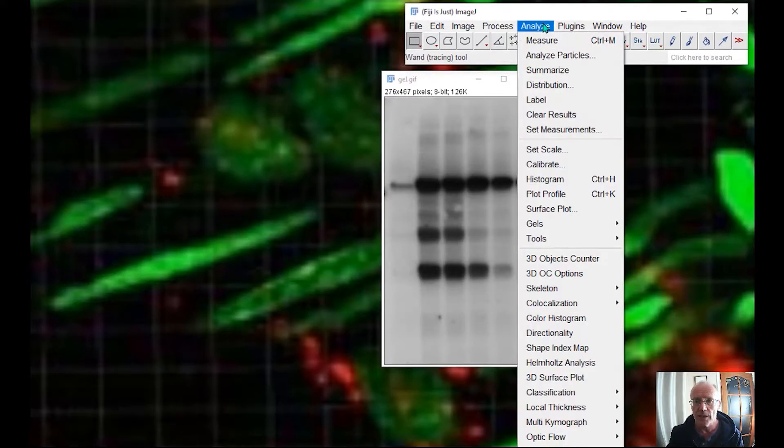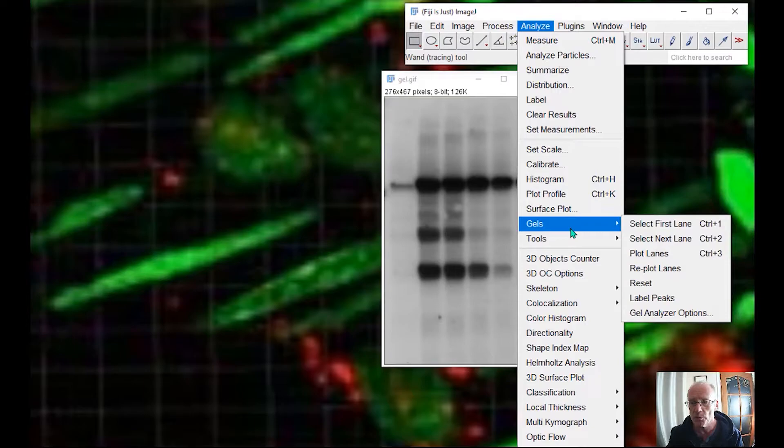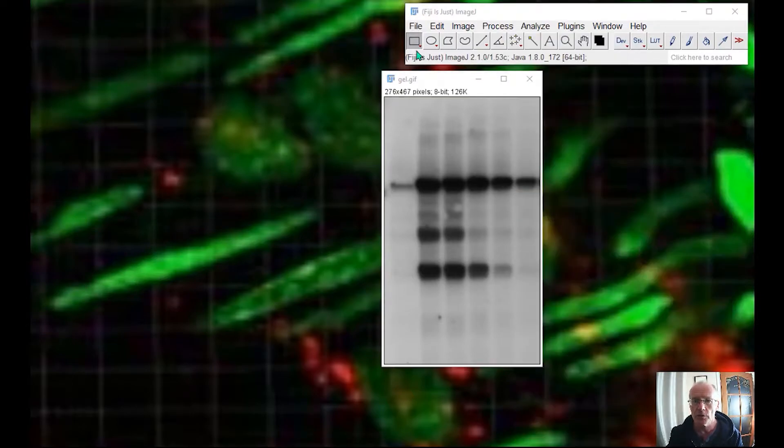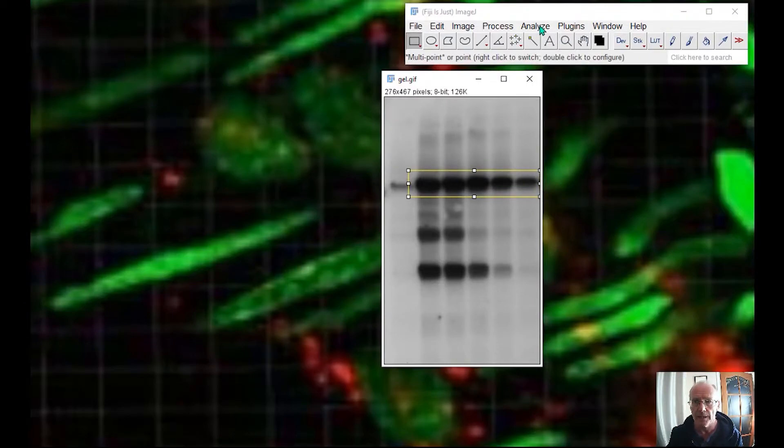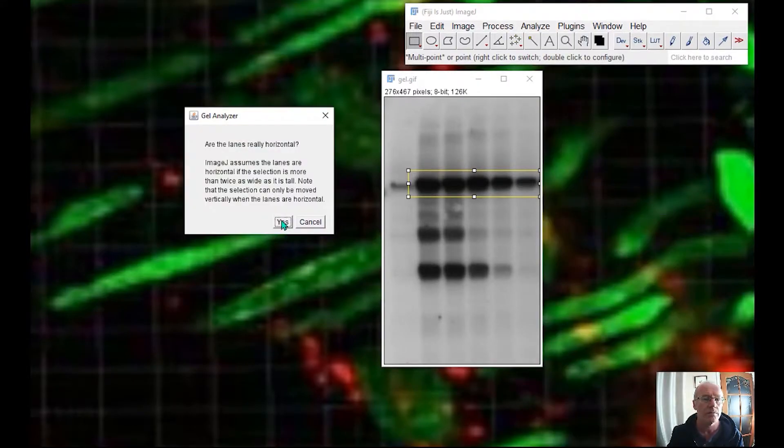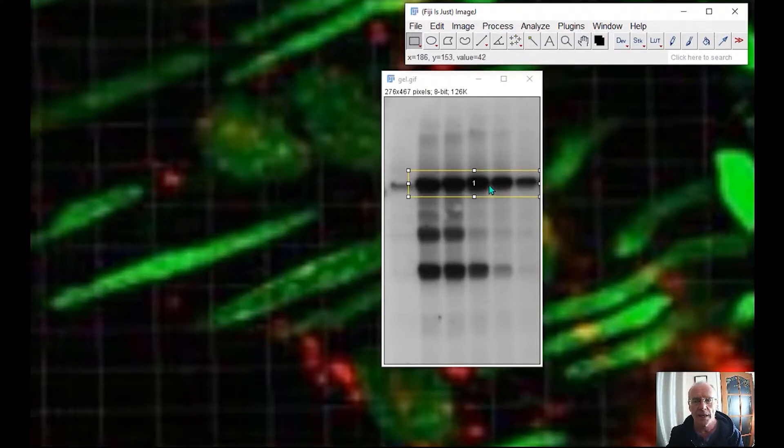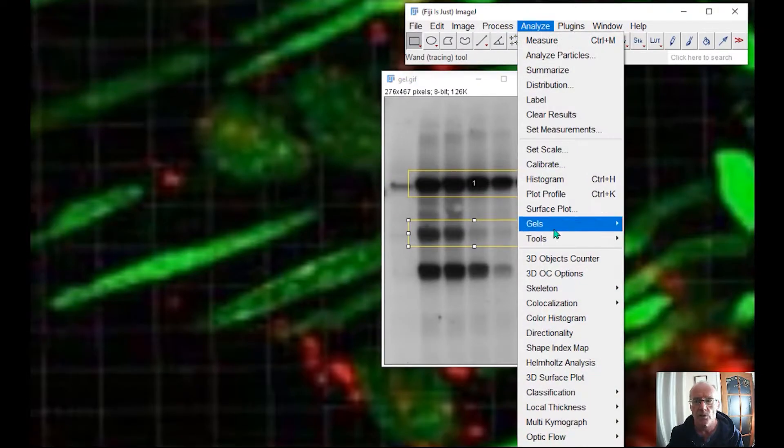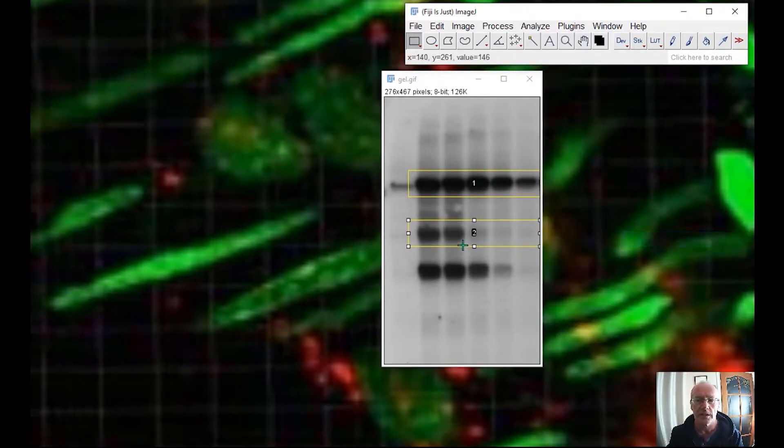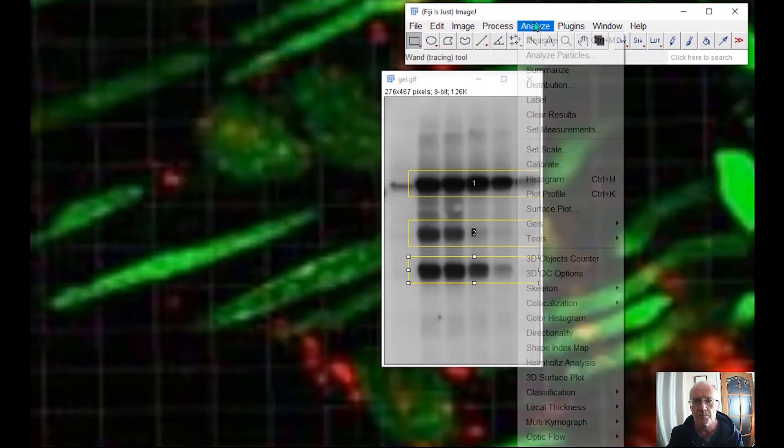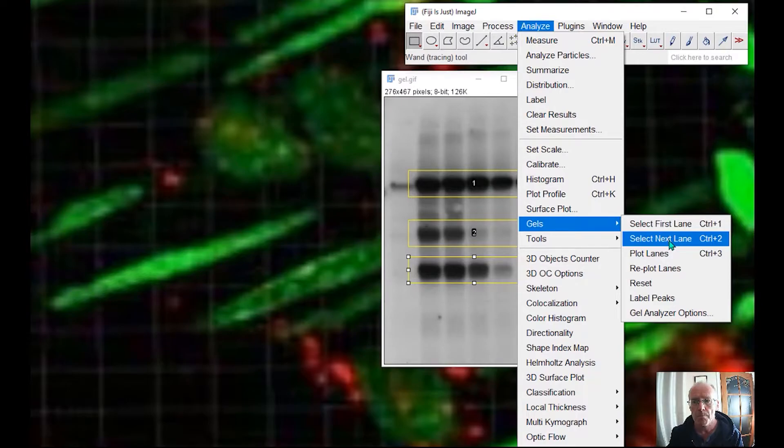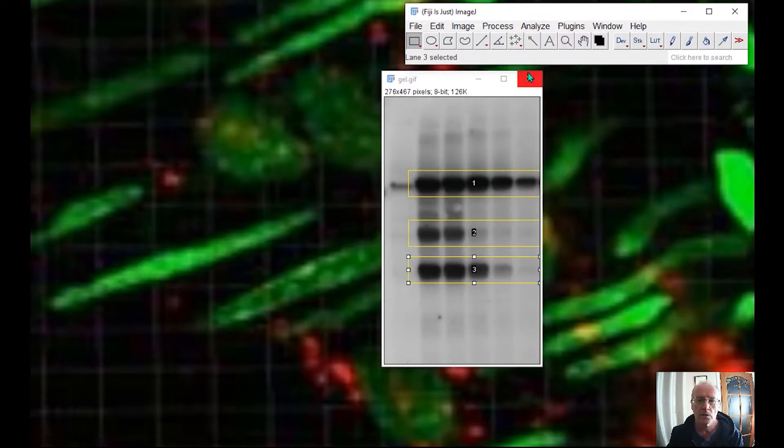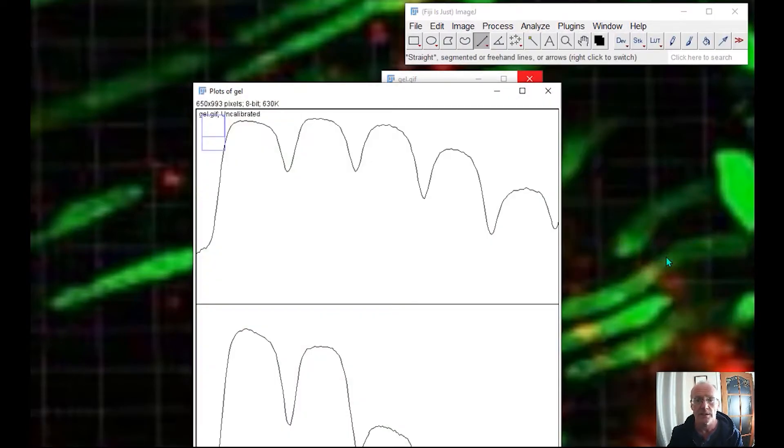Now, there is a gel analyser. And so those of you who measure gels will know this. You first of all need to make a lane box that marks the lane. And you go to the gels and you make this your first lane. And then you can make a second lane and select next lane. And then to the third lane. And then quite simply you go to gels again and you plot the lanes.